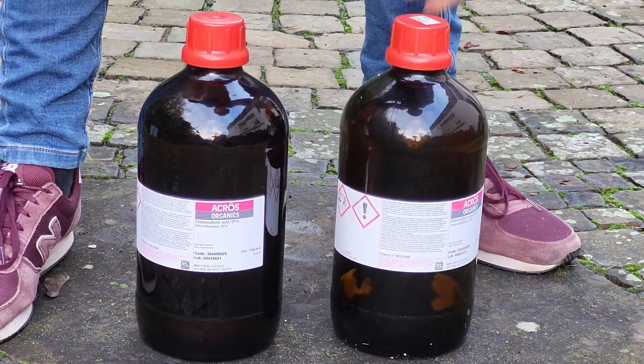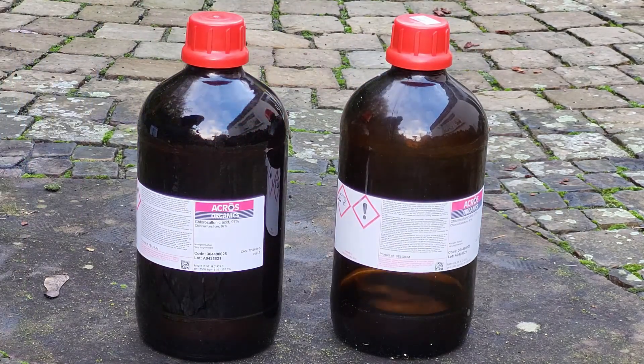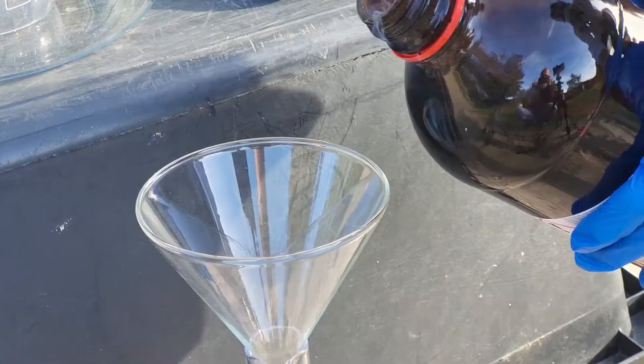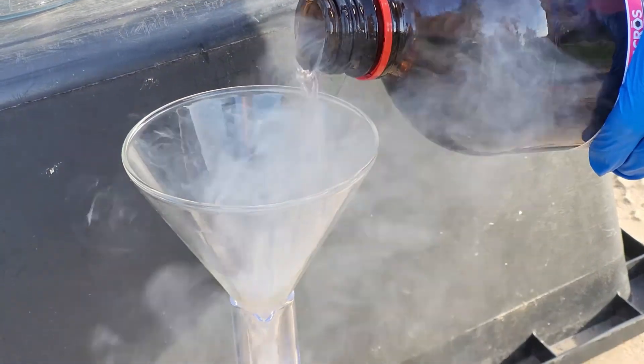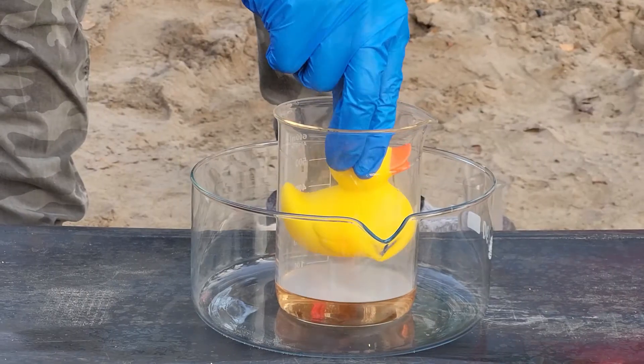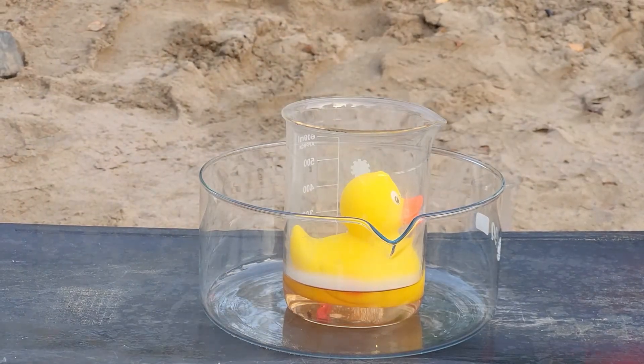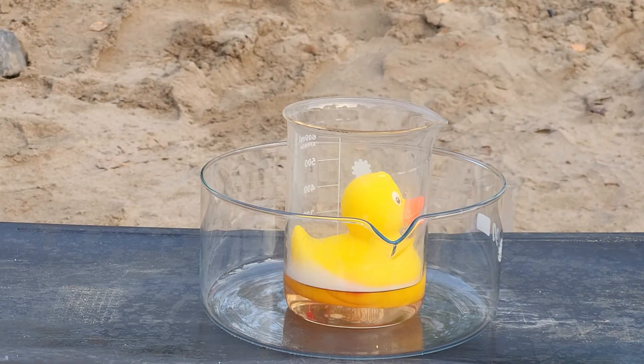In these bottles you can see a couple liters of highly corrosive super acid called chlorosulfonic acid. Today I will use this to show you how dangerous exactly the super acid is, so you know what the real acid made by chemists is capable of doing. Trust me, it's a lot worse than you might think.